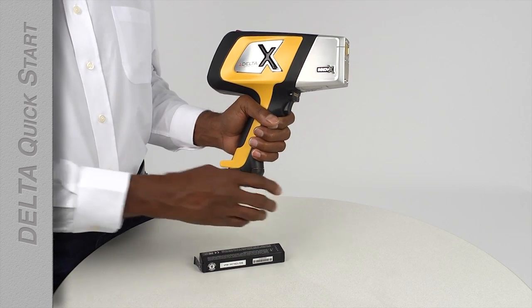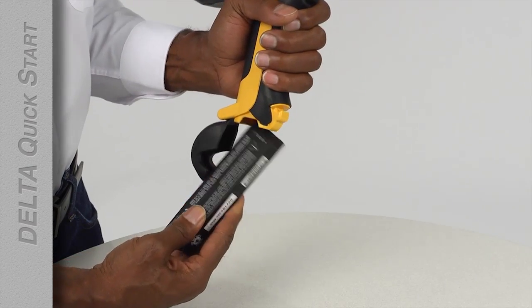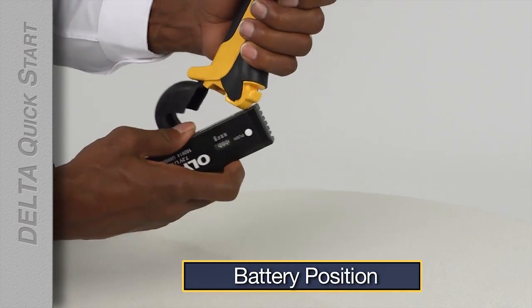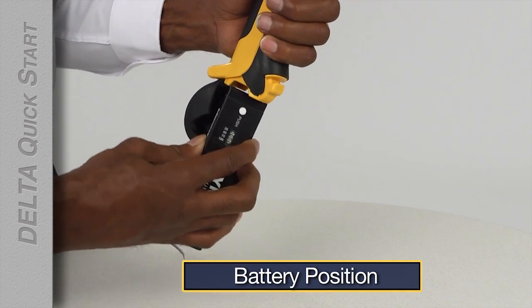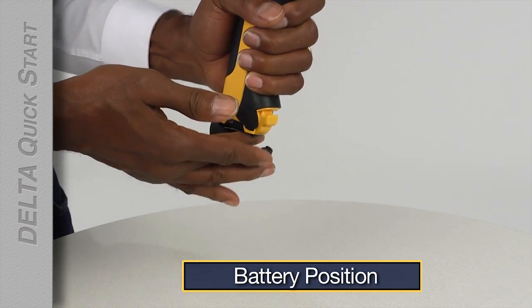To use the analyzer, pull open the battery latch and insert one of the fully charged batteries, then close the latch. The batteries only go in one way. If the battery isn't sliding into position, take it out, rotate it, and slide it back in.